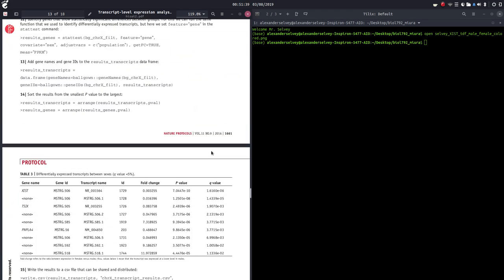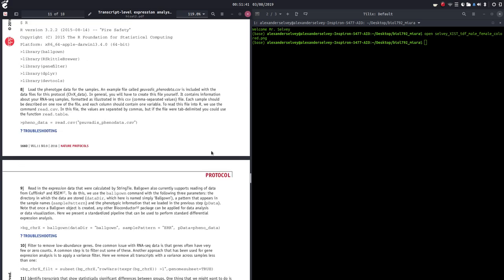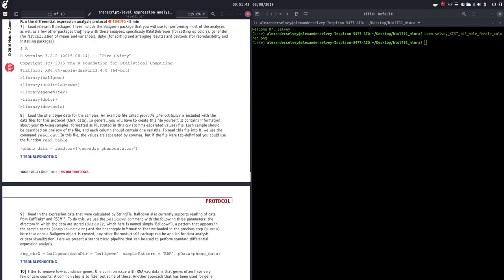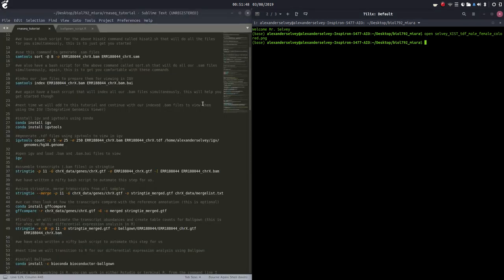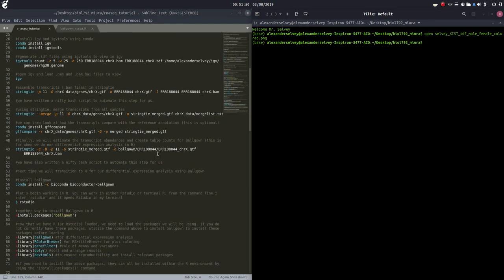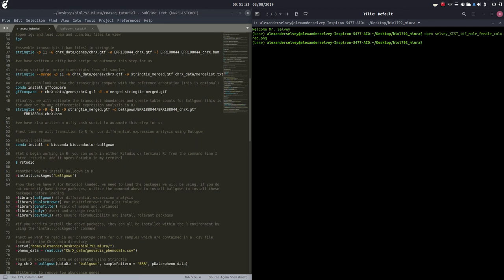So in the protocol we're going to start on step number seven: run differential expression analysis. Last time I mentioned that we used StringTie to merge our transcripts. We used GFF compare to check out how the transcripts compare with the reference genome annotation. And then we used StringTie to create our ballgown output files.